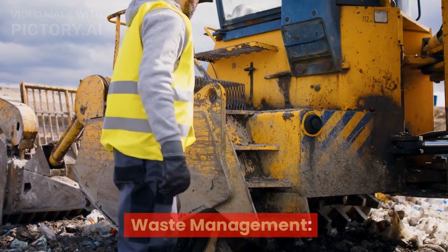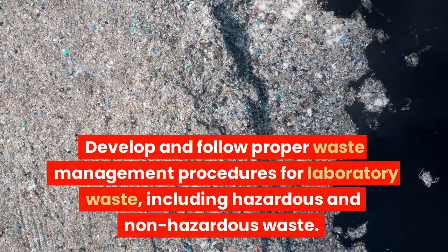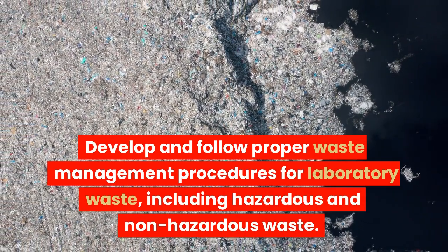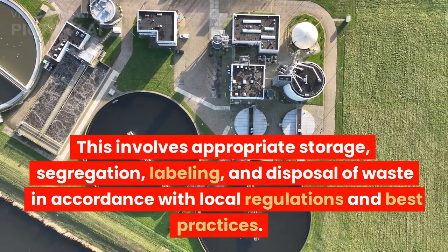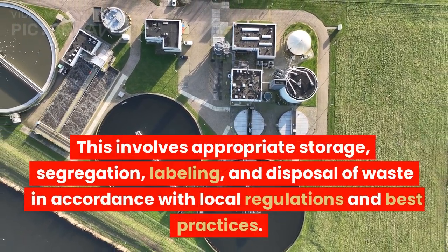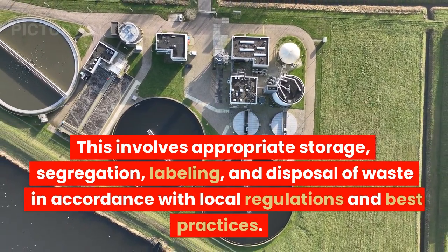8. Waste management. Develop and follow proper waste management procedures for laboratory waste, including hazardous and non-hazardous waste. This involves appropriate storage, segregation, labeling, and disposal of waste in accordance with local regulations and best practices.